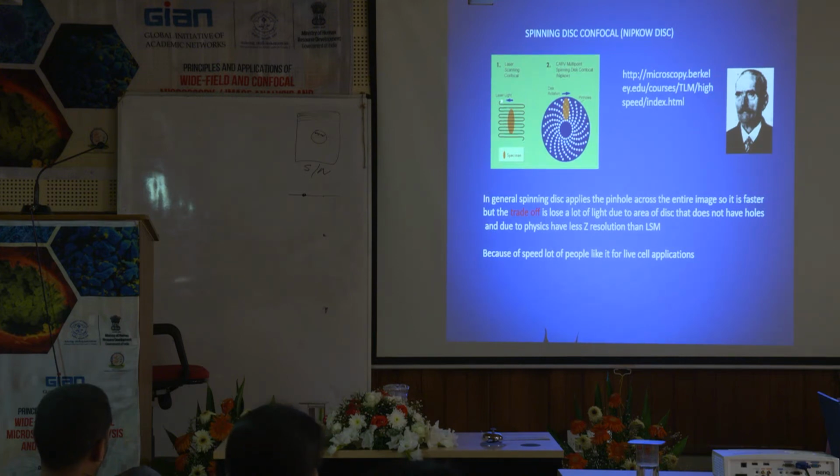I've had some luck using the laser scanning for live cell. Just depends. The other thing about cells is some cells are just a lot tougher than others. And health of the cells is the main thing. Anytime we do these kinds of experiments, and I don't know how much tissue culture you do, but if you're looking at your cells and you're getting ready to go do a confocal experiment, and your cells don't look like that normal, healthy look they have, don't bother.